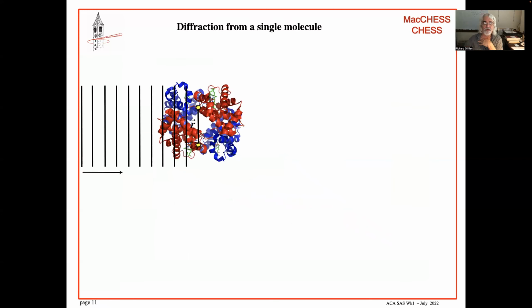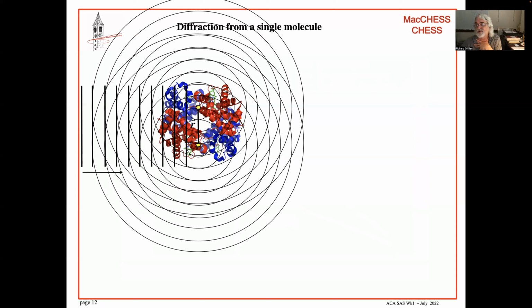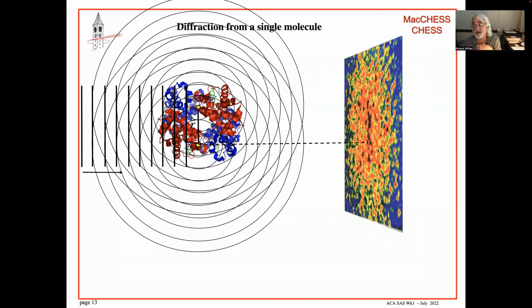All right. So you have a protein here, and you have tons of electrons. And the way to understand scattering in a simple way is thinking of pairs of electrons. And you have a wave coming in. Those pairs create those ripples on a pond I was talking about. And then if you have a detector, you're going to see what's called a speckle pattern if you were able to hold a single molecule up, which you can't really do. You get a speckle pattern like that, okay?